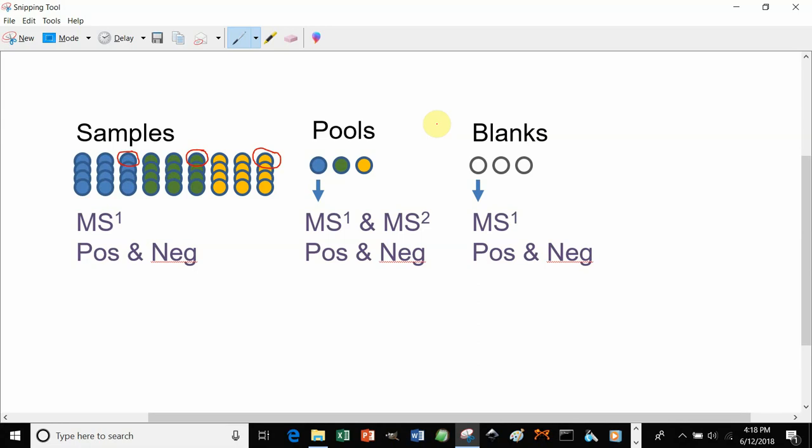If you do not have extraction blanks, then you can use solvent blanks for this step.